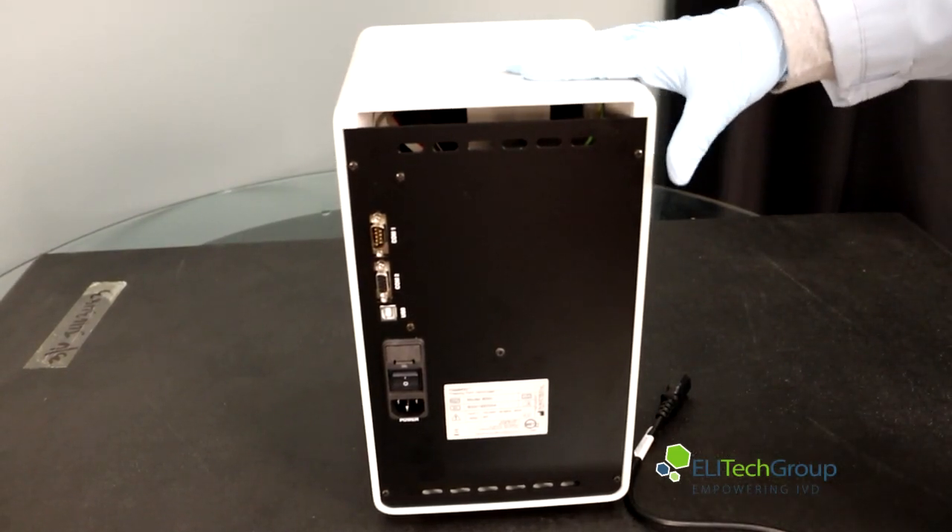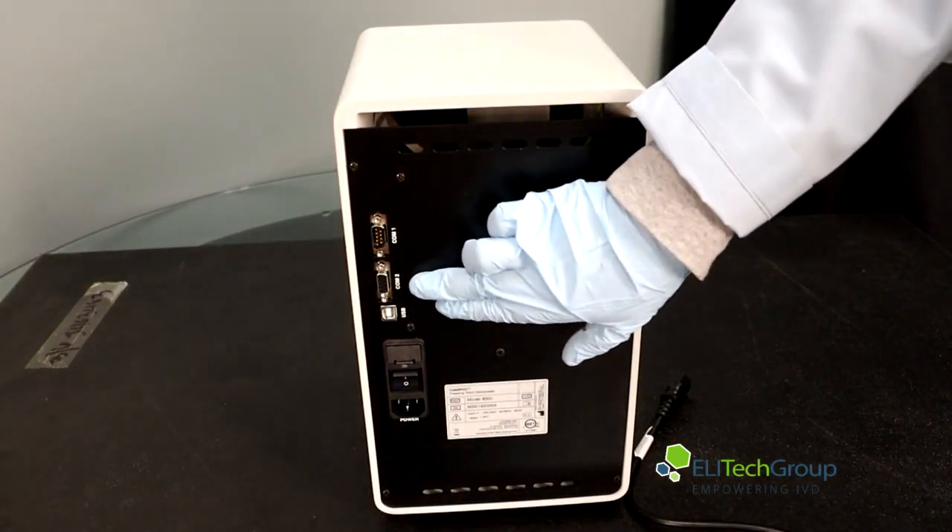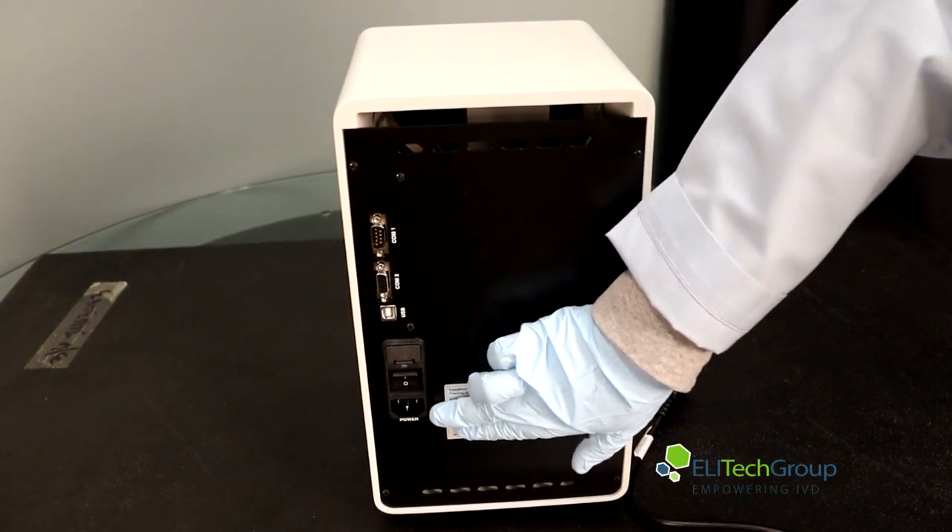Here's the back of the freezing point osmometer. We have the COM1 port, COM2, USB, your power switch, and your power source.